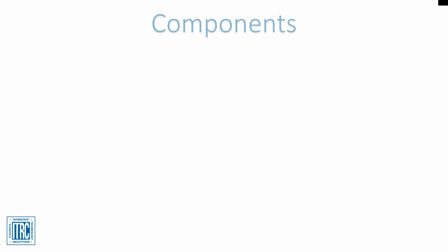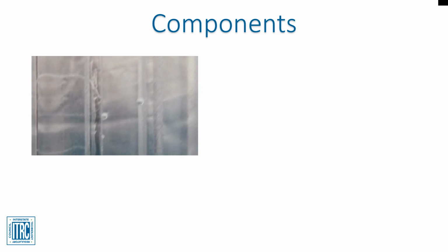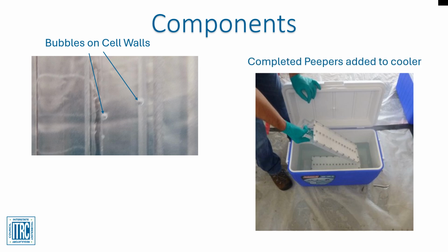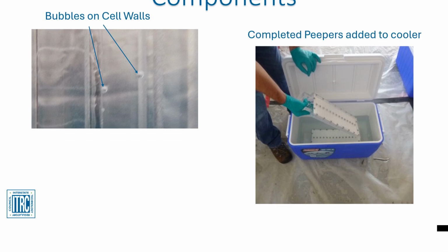The HRPP is typically deployed in redox-sensitive environments and needs to be filled with reagent water without air bubbles because residual oxygen can result in biased results. When assembled, care must be taken to prevent air bubble formation. The sampler should be assembled and shipped to the site ready to deploy with minimum handling of the samplers. The samplers must be kept cool and avoid oxygen until they are deployed.